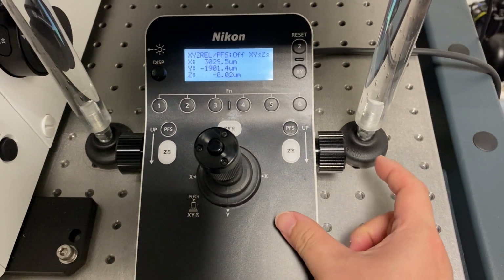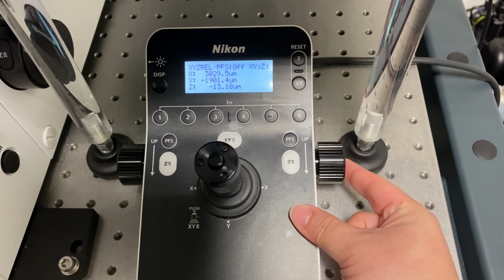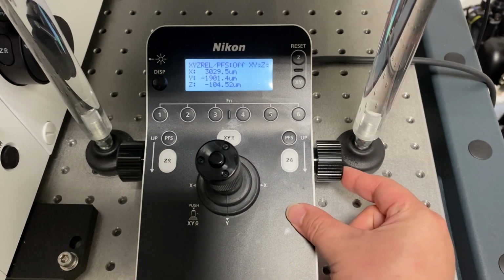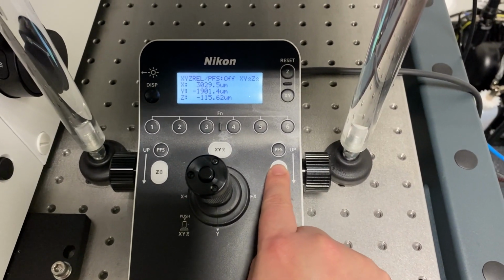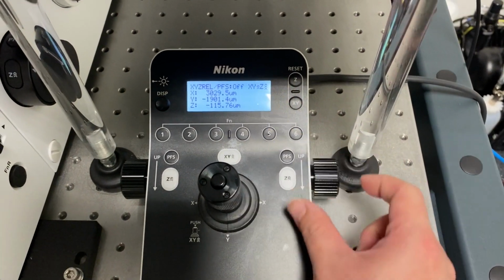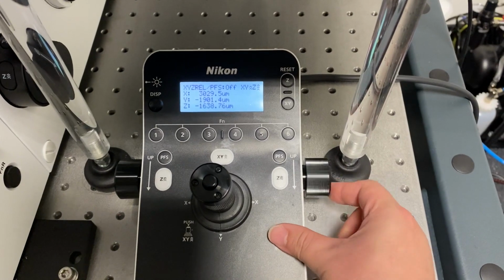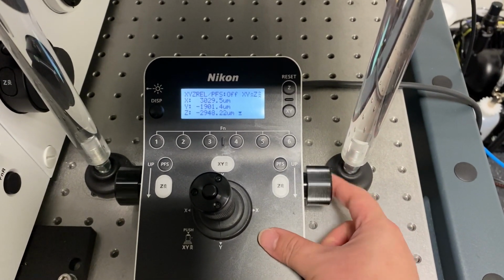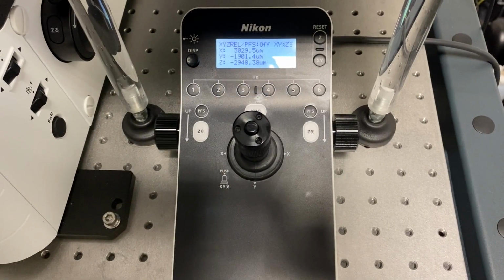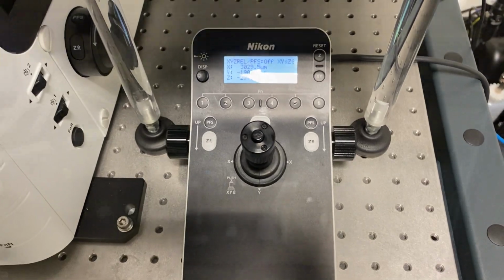Next, you want to lower down the lens. Away from you is down. Once you know which way you're going, you can put the speed at which to move the lens back to fast and go all the way down to the bottom. Once you are all the way at the bottom, you can then remove your sample.